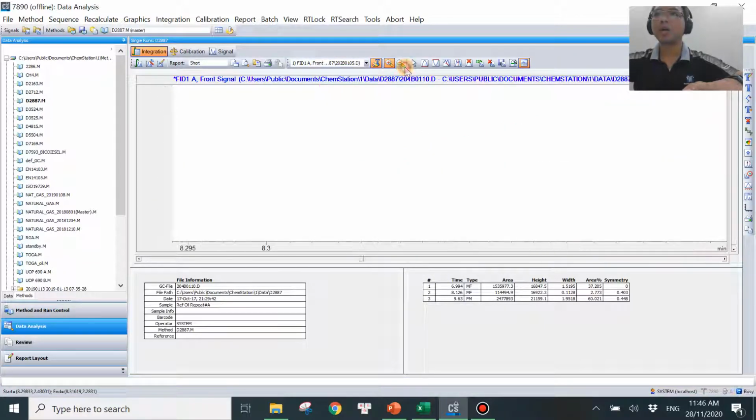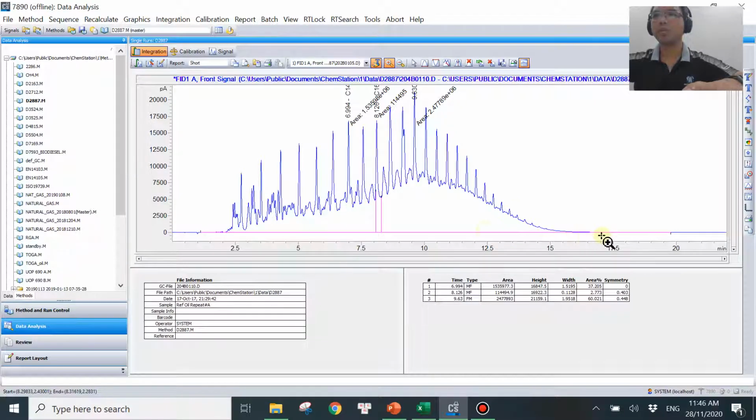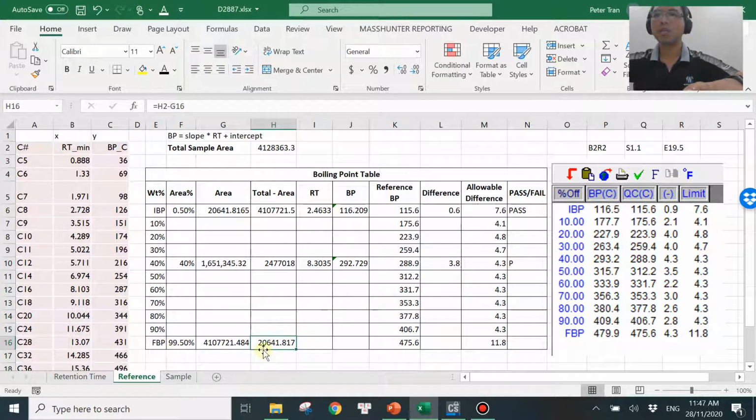Okay, let's zoom out a little bit more. So that would be 99.5%, which should be somewhere on the right side here. What you need to do is remove the last iteration if you want to, by clicking this one. Then you can remove one more if you want to. Okay, I guess it's somewhere over here. Let's try. And here is up to 80,000 remaining, and we just need to have 20,000.